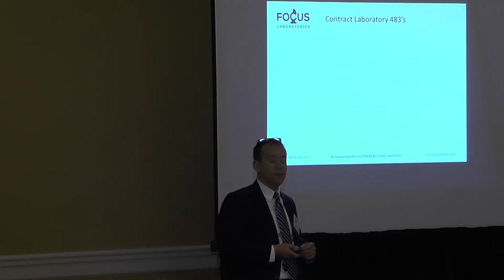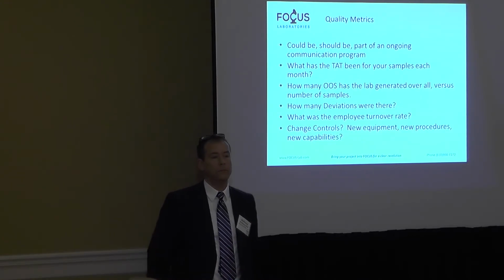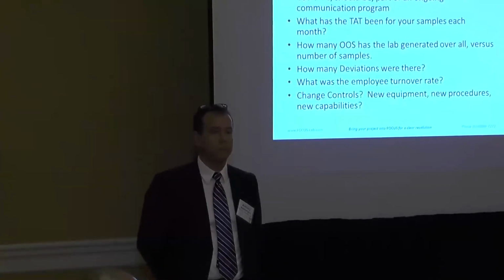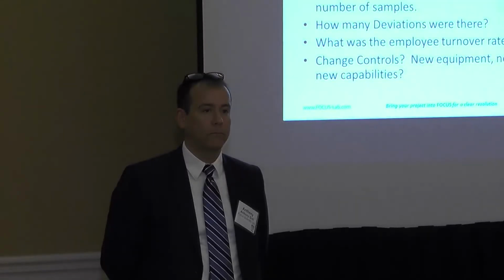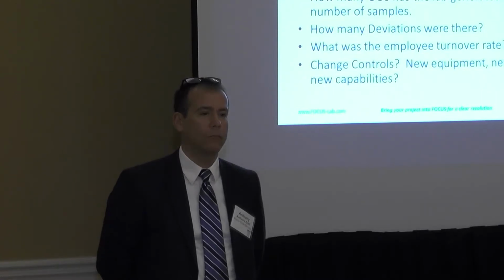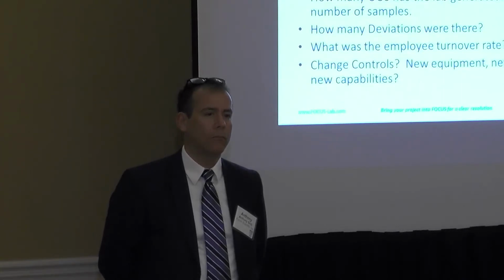On your question, Tony, on the OOSs, how many OOSs are required? Question. I use some contract laboratories. I use them for development work, experimental work, and we don't know if it's going to work. And we use laboratories for routine QC analysis. It may be the same analytical method. So I'm always concerned about potentially generating OOSs on experimental samples that go into the regular metric reporting system, because the first time I walk in as an auditor and say, I'd like to see your list of OOS events. If I'm an FDA investigator, I would expect that to be the first question. Is there any special way we should be looking at managing development samples versus the OOS on commercial product using approved methods?